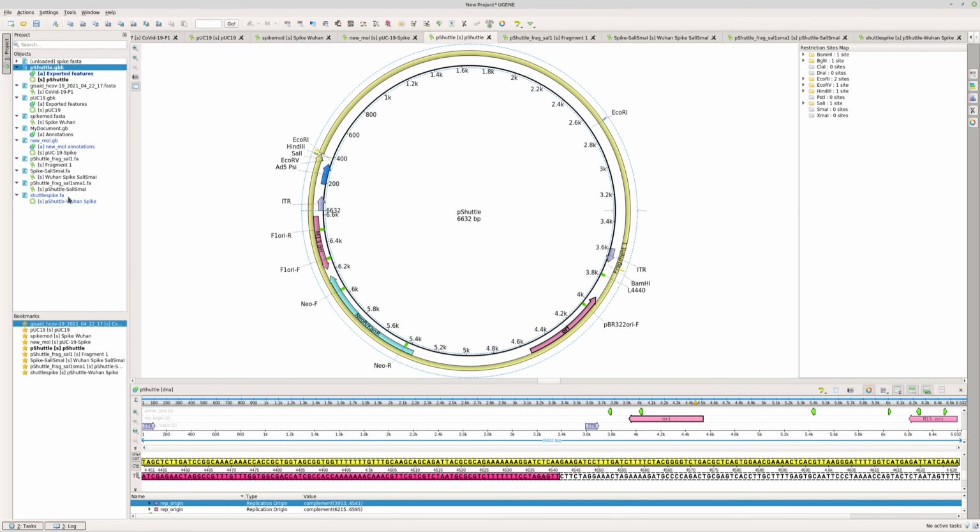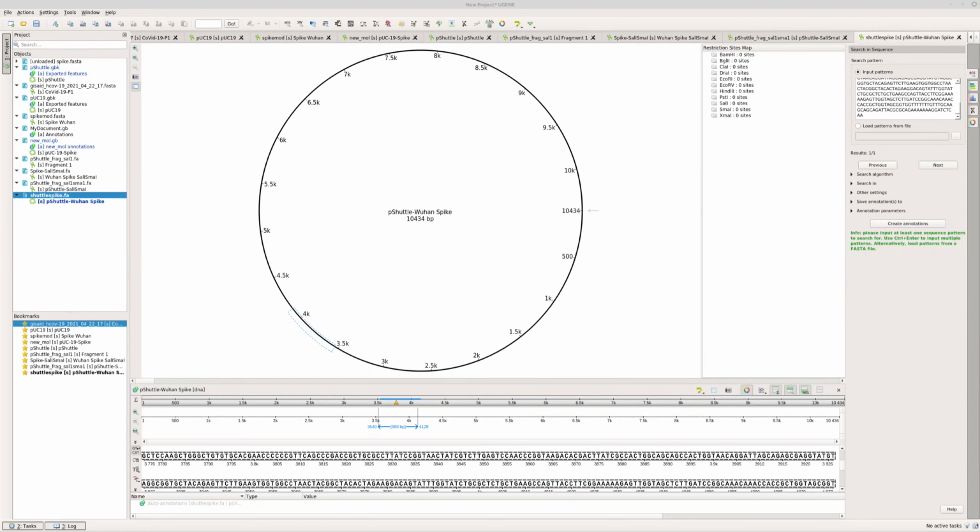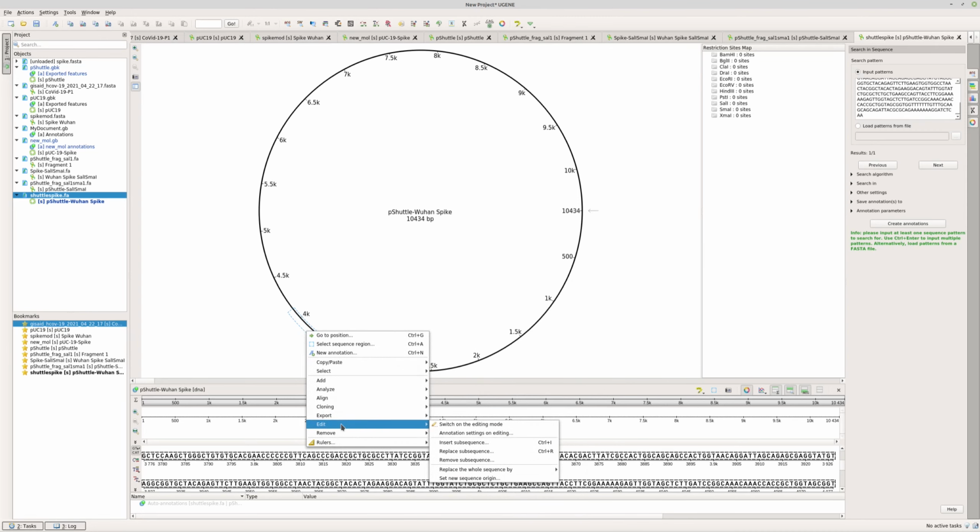We can go back to our unannotated item here. So here we are going to go search for this bit, and as you can see, it actually has found this origin located in this space, right? So that's important, and we can actually go here and think about adding our annotations, and to start over with adding these sort of useful portions of this that we really want to know about, right?